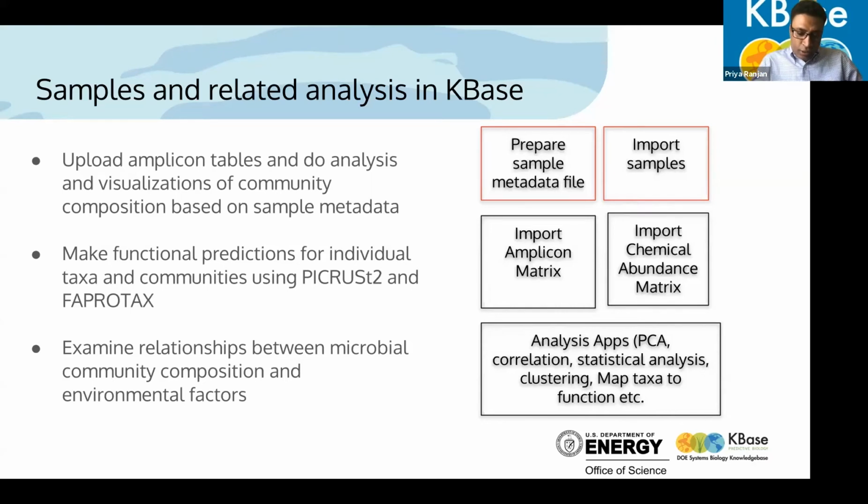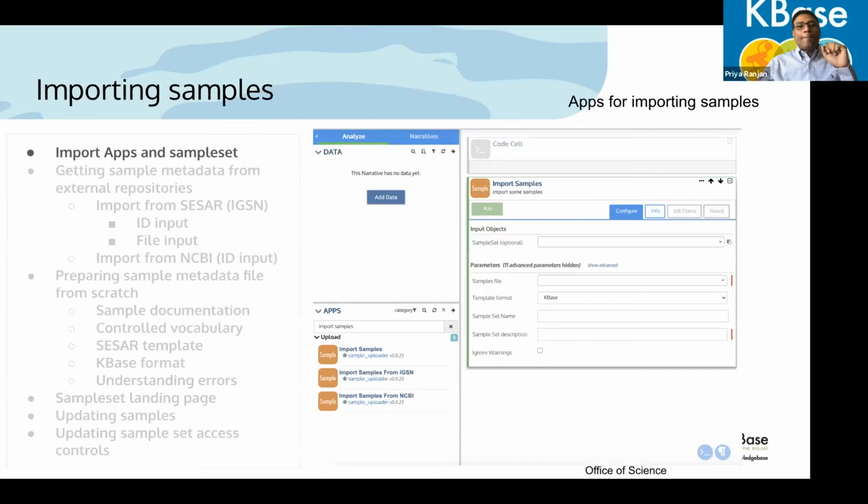If you are just one person uploading the data, it may not matter much. You already know this is the data that you have uploaded. But if you are working as part of a team, I'll show you how you can see all the linked data that correspond to the samples, and the ontology is linked to it. So that's the first thing. Let's look at the apps.